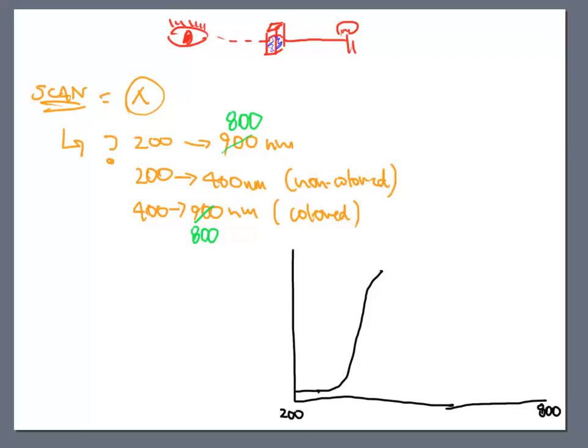Well, eventually that molecule has to continue to go through the buffet line, and it might see some of those items that it doesn't like on the buffet, and it passes those up. So what begins to happen is that this molecule begins to say, no thanks, I don't really like any of that stuff. And then it goes back down and it goes back to baseline. Okay, that is what we see on the computer screen. That is a scan. We're picking up the part of the buffet line that the molecule really enjoys. That's the purpose of the scan.